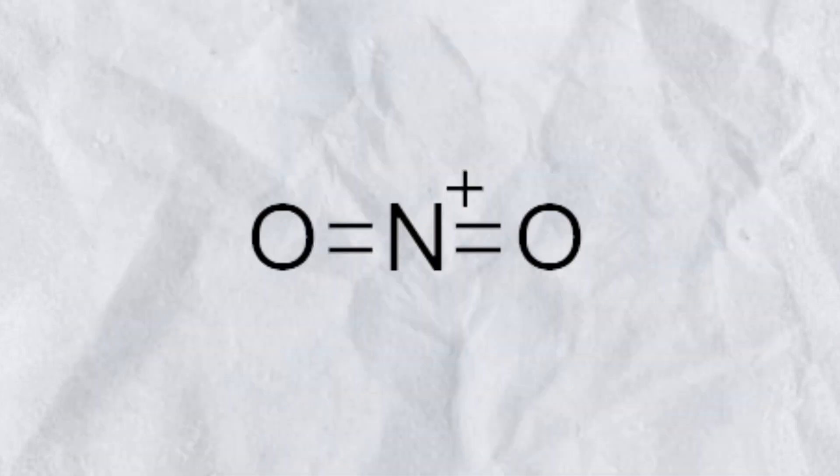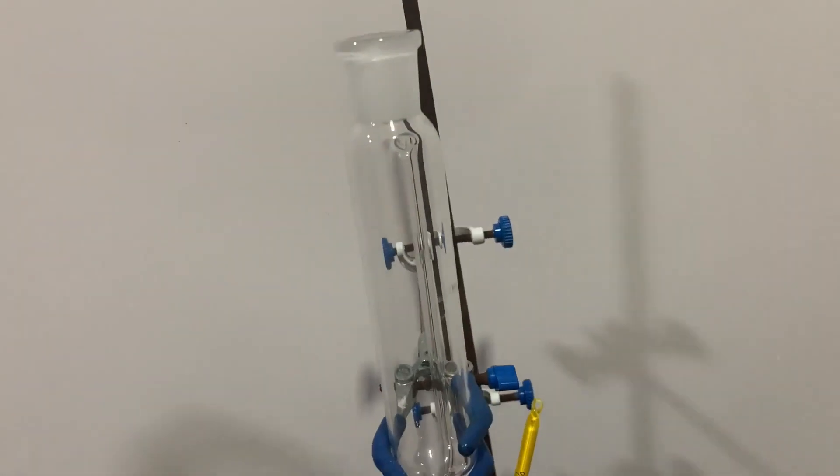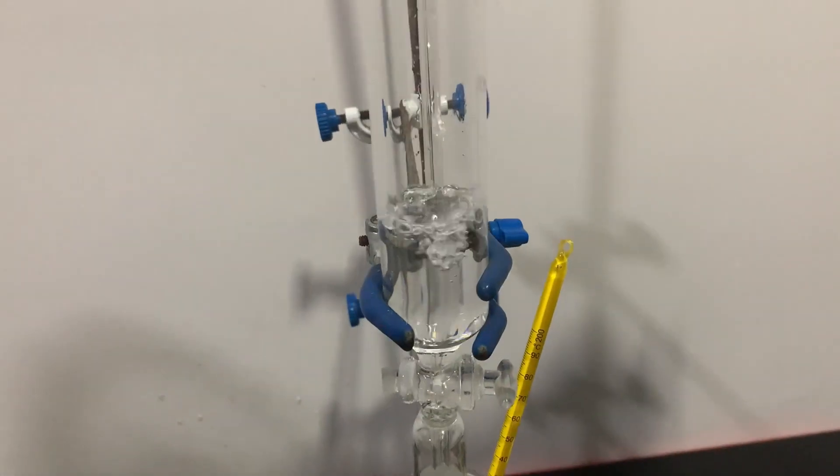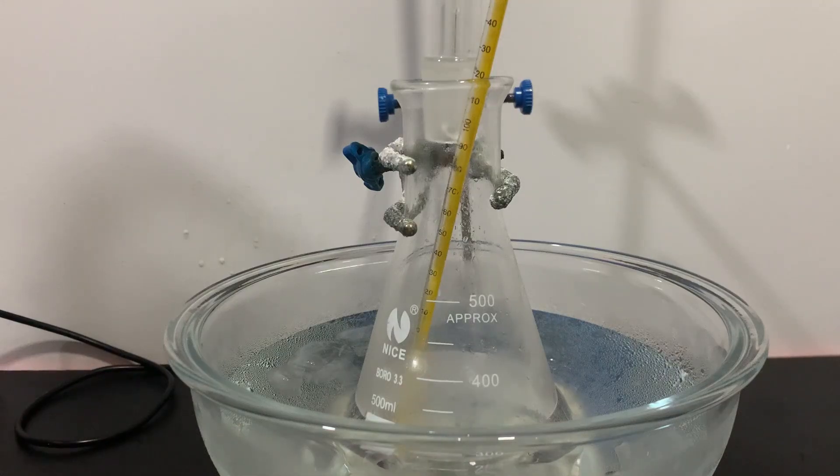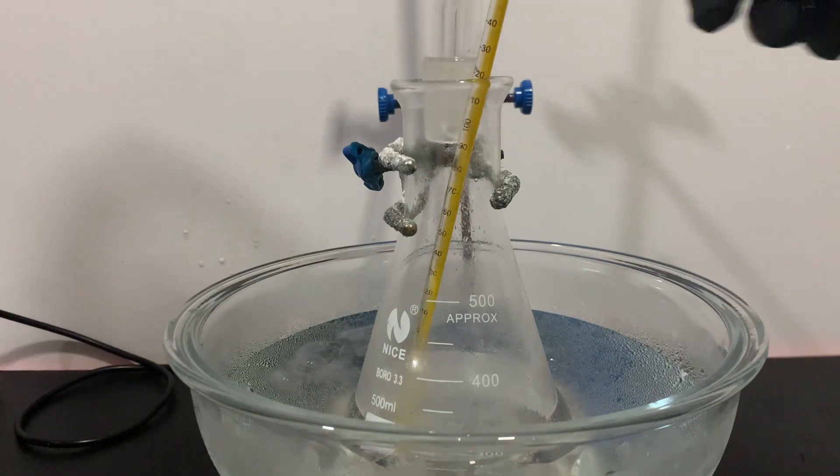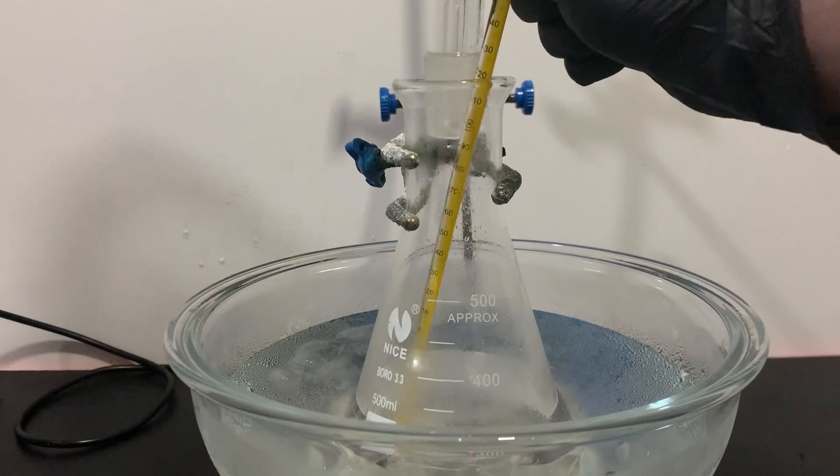This will then yield our desired nitronium ion. An addition funnel was charged with 57ml of benzene and the benzene was added dropwise to the nitrating mixture. The temperature was also kept below 50 degrees Celsius to prevent side products from forming.